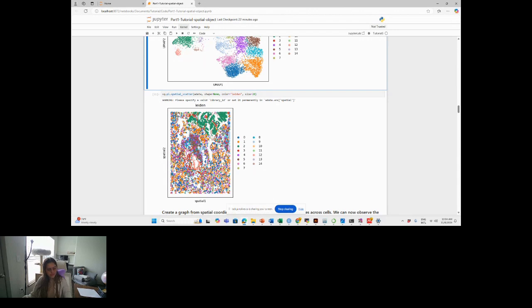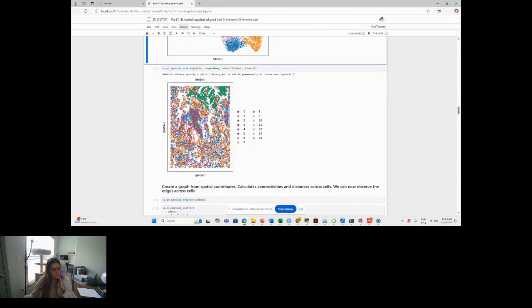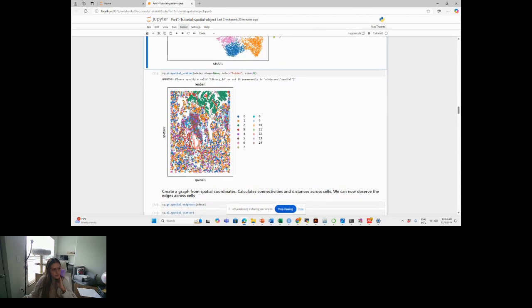Here, the green, what is the name of the cells for the green, Carla, that NanoString provides? The cell type, yes, it's tumor. Those are the tumor cells, right? Yes. So they did their analysis. They tell us these are tumor cells. Now we can see that they express similar genes, and they also have a spatial location. They're close to each other. So the tumoral cells are there. However, we see other types of cells represented as a different color within the tumor. And that's what we're going to be showing next.